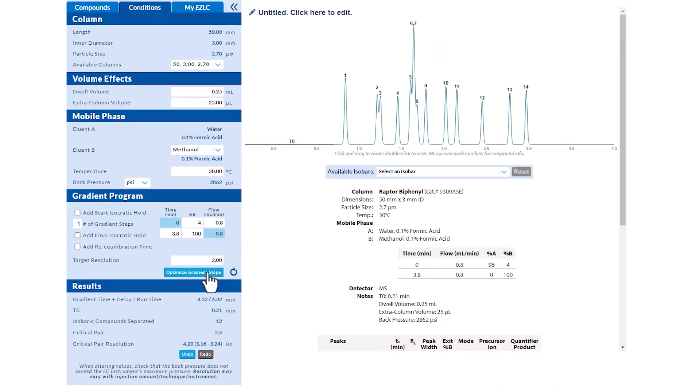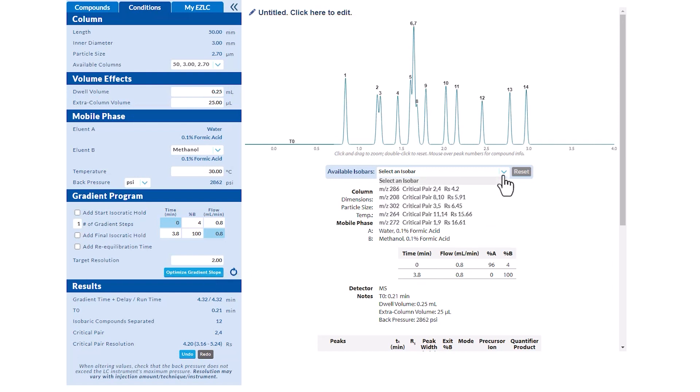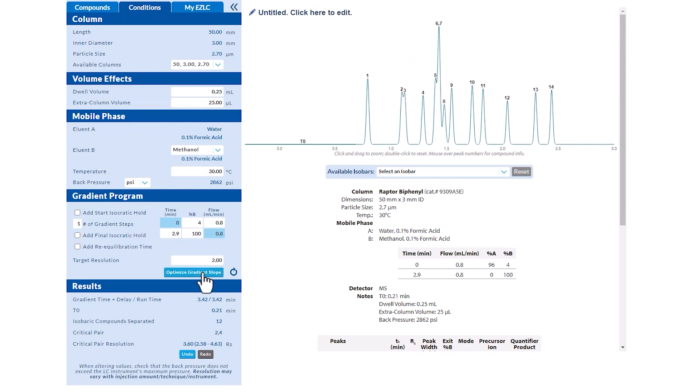The results section at the bottom of the tab and the modeled chromatogram have updated automatically showing a shorter runtime. Our isobar resolution remains high, so we'll click the button again. We can continue to optimize by clicking the button until we're pleased with the separation or the button has grayed out. This indicates that no further refinements are available.